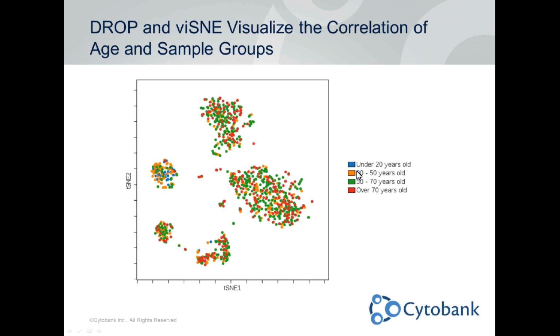Another thing you can do if you have more annotation channels, like for instance in this data set, this is just one of them. What I showed you before, there were probably 6 or 7 different annotation channels. And if we look at the age distribution across our different islands or cancer types, you can see that really only the Wilms tumor has patients that have been under 20 years old, and that's just how that cancer operates. It shows up sometimes in people under 20, and the rest of these are usually acquired later on in life. So this is another nice way to visualize the data.